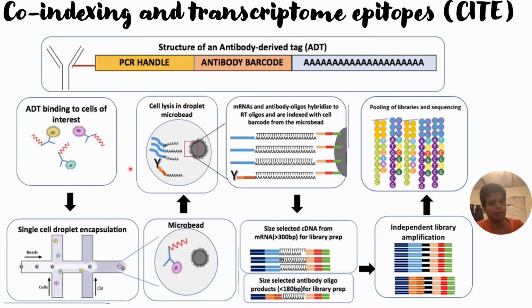Previously, we could identify the changes in a group of cells. However, with this sequencing, we can identify the changes in the single cell's mRNA with the help of this transcriptome, which will read the mRNA within the single cells. So let us understand how this works.